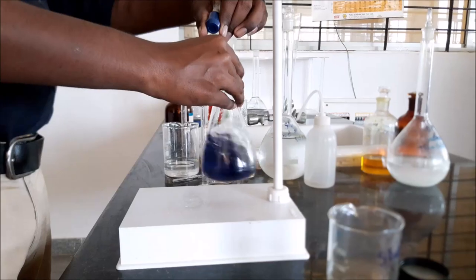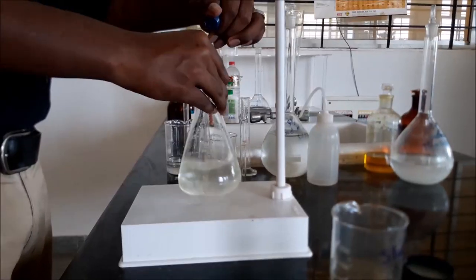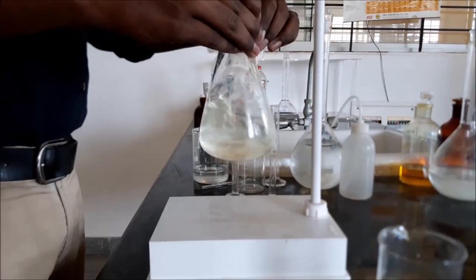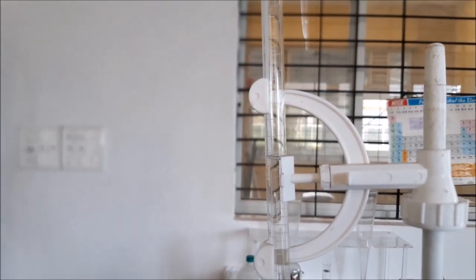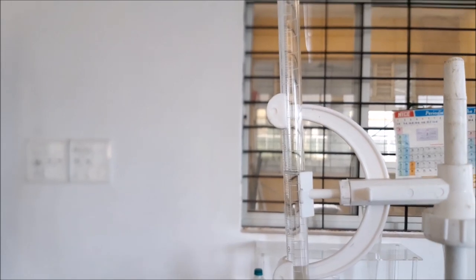Titrate until the blue color disappears or fades out. Note down the burette reading for the calculation of amount of residual chlorine that is present in the sample.